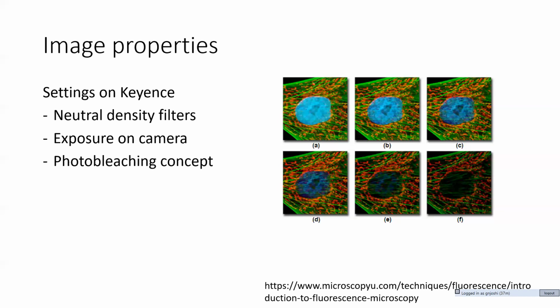Now, this all depends on the fluorophore. If you're using a fluorophore like FITC, it's pretty terrible. If you're using something like Alexa 488, it's okay as long as your sample is mounted with a good mounting media. In your case, you have your cells which are in media. They are not in any kind of mounting media. So photo bleaching could be an issue if you are trying to image through Z sections or so on. But I think your fluorophores are pretty bright, so I don't think that should be a big deal. But that's something to be determined for your samples.